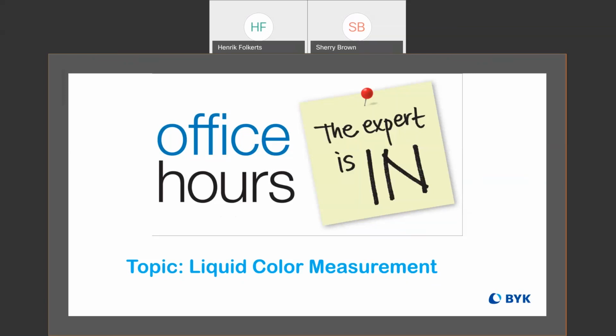So it does use the entire range for it, but APHA itself is more or less a yellowness scale. So it really is isolating the yellowness of the sample, and that allows it to make it into a linear scale that's just 0 to 1,000, rather than something like LAB, which is a 3-dimensional scale. So it keeps it a bit simpler. But yeah, it really does focus on the yellow, and if it's not a perfectly yellow sample, or if it's too much off yellow, it would really just be off scale, and the APHA wouldn't be the appropriate scale for that. Right, okay. Thank you.